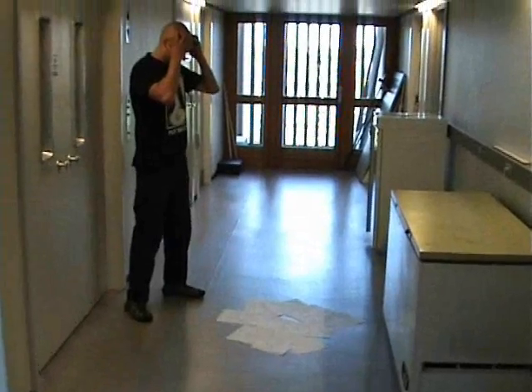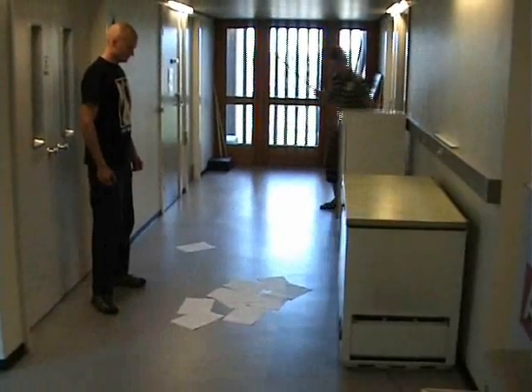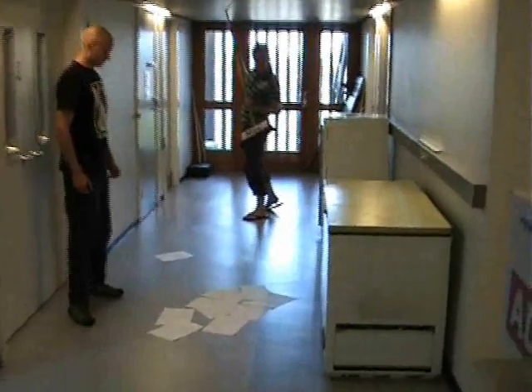Are your spectra scattered about? Do not despair. Gather them by MSC.